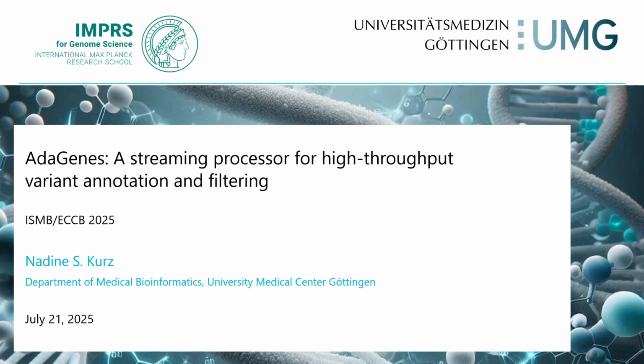I'm from the Department of Medical Bioinformatics at the University Medical Center Göttingen, and today I'm going to present AdaGenes, a variant annotation and filtering pipeline for whole genome and whole exome sequencing files. AdaGenes comes with unique new annotation features and is both usable from the command line and our interactive web interface.